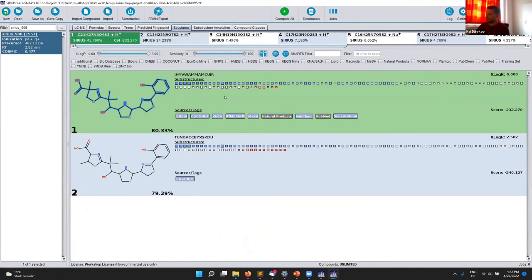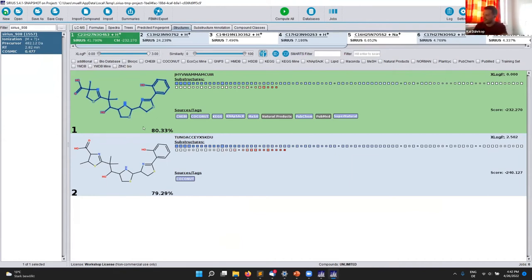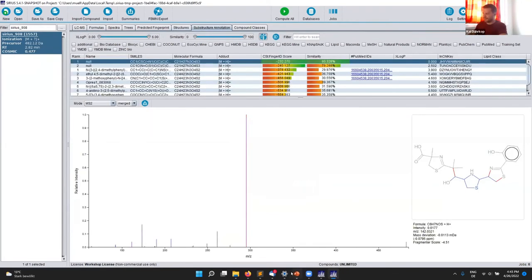There is also a percentage score here — basically the Tanimoto score between the prediction and the real fingerprint. You can think of it as how much of your molecule is predicted correctly. In this case, 80% means the machine learner can predict 80% of this molecule and only 20% is uncertain. This is a really nice value to consider when evaluating correctness. If it's around 50%, then it's already a little bit fishy.